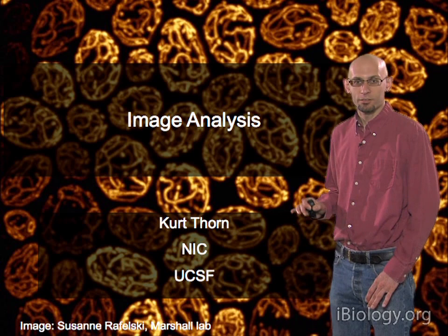So that's the first thing I wanted to talk about, are just these basic image corrections. And now I want to get more into image analysis or image processing, where you're applying manipulations to your data to try and enhance or suppress certain features. An extremely common and very powerful technique is what's called digital image filtering. And the idea here is you have what's called a kernel, so this little matrix of numbers here. And at every pixel in your image, you go and apply this kernel and calculate some product between the kernel and that portion of the image, and then replace that pixel in the image with that product.